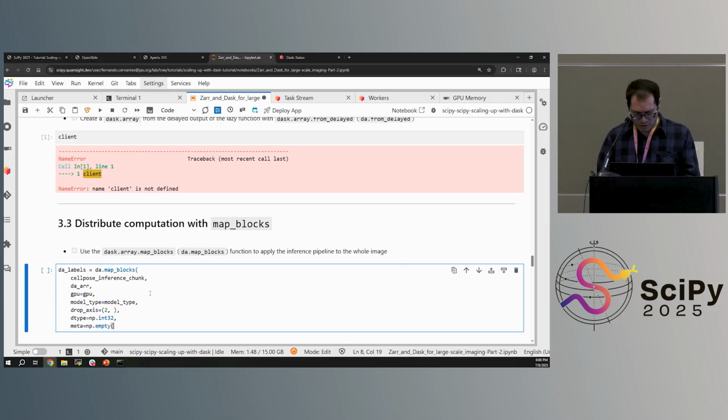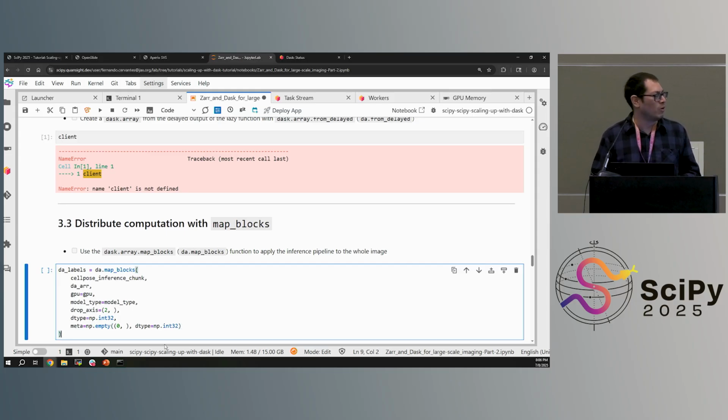And we need to tell it that this is an RGB image, so there are no specific channels for different objects that have been stained for. So we can just tell it to use the 0, 0 channels. Commonly, if you have actual staining of different objects and those live in different channels, you can specify that. This is a Cellpose thing. So this is converting that into a closer input that is required by Cellpose, but we still need to do some normalization step.